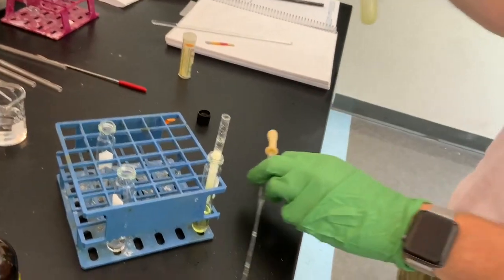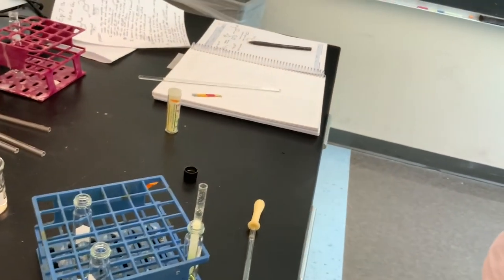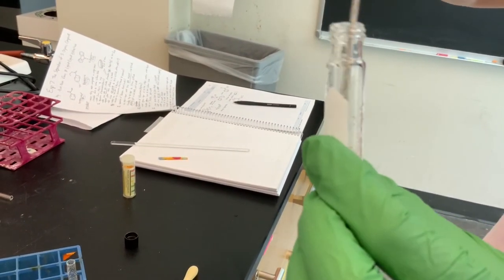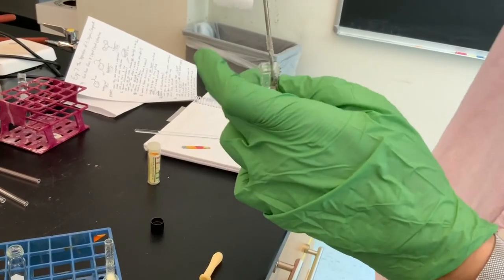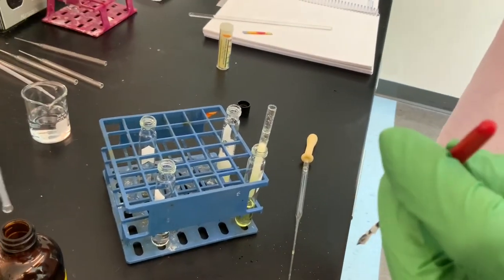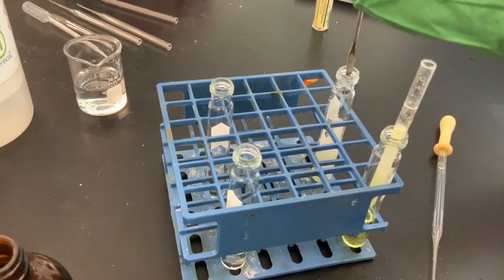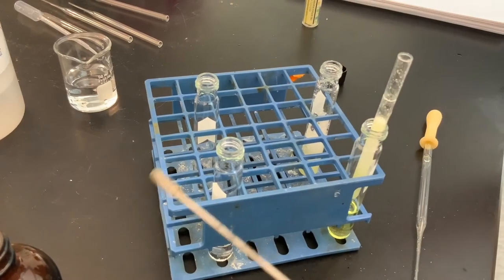I'm gonna try and break that apart with a spatula. I should have probably done that in the first place rather than trying to use glass. So now I've got more of a slush rather than some just hard ice that I'm trying to break through. Rinse this now, of course, too. So you can see why organic chemistry is so time-consuming in the actual lab. Everything looks great and nice on paper, but when you're actually trying to do the reactions and then collect your product, it's much more time-consuming than you might assume.